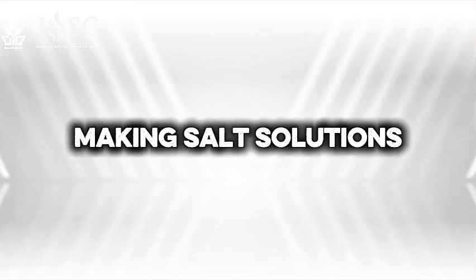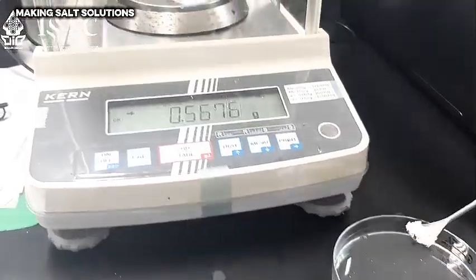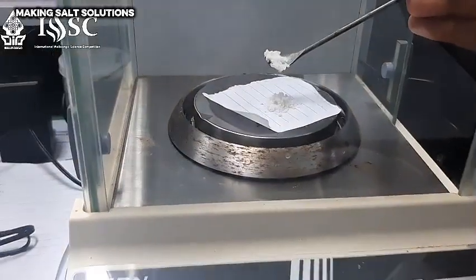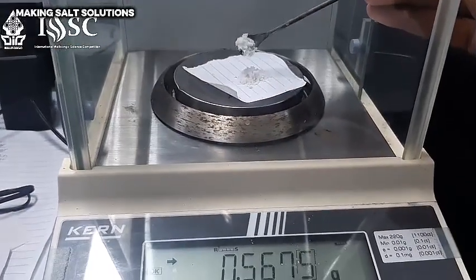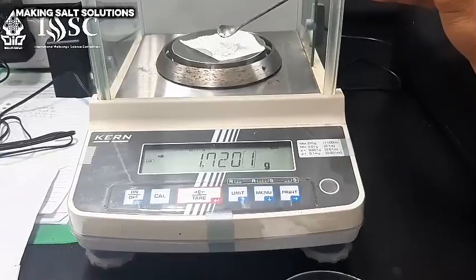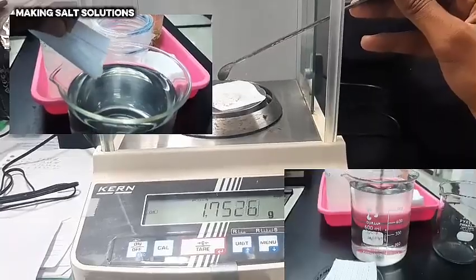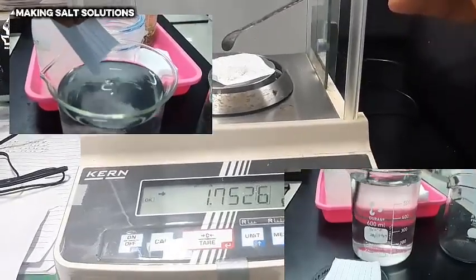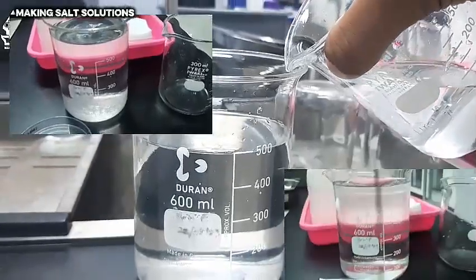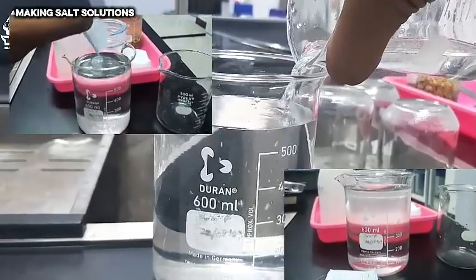Procedures. Making salt solution. Firstly, calculate the sodium chloride solid masses needed to make 0.05 molar and 0.1 molar sodium chloride solution. And then mix 1.75 gram of sodium chloride solids with 600 milliliter water in the glass beaker to make 0.05 molar sodium chloride solution.